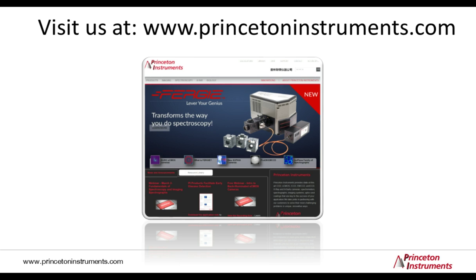The other reason is, as I showed, how you can calculate the energy and how it's related to the wavelength: it's inversely proportional. Raman produces a fixed energy shift. However, spectrographs typically operate in wavelengths. As I move the grating, I image a fixed wavelength range. If I use a longer excitation wavelength, the same amount of energy shift will be spread over a much longer wavelength range. That can be a means of increasing the resolution of my Raman experiment, because now the same Raman line is extended over more pixels on my detector. So those are two reasons I can think of.